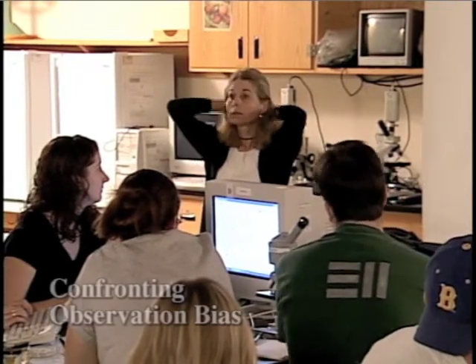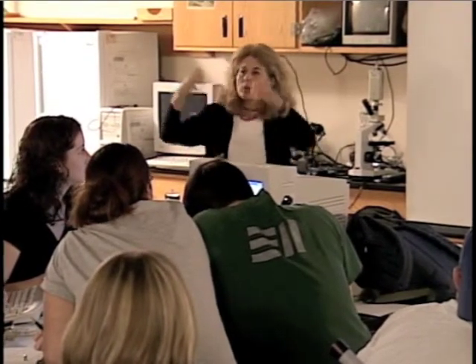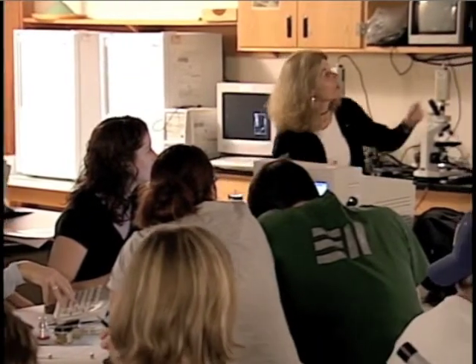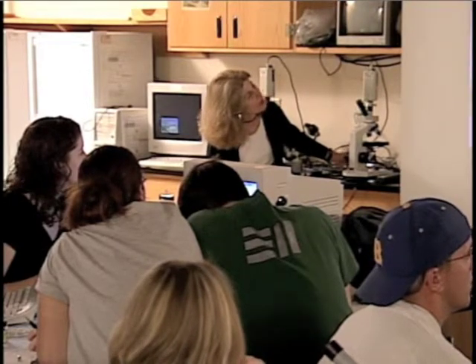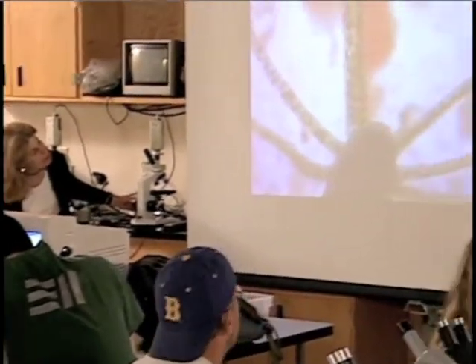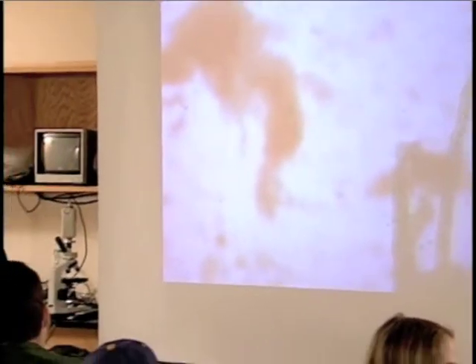So what do you think about that? Do you think it's going to prefer yeast for a food? You don't think so? This is a tough one visually to call. I think Hydra prefers these little critters called Daphnia because it captures them and stuffs them in its mouth. But it is very difficult taking a look because the animal seems to collect things on its tentacles, maybe because they are kind of rough. They actually have little stinger cells in here that they release to capture. Yeah. Well, he's probably searching for that critter, maybe he's hungry.